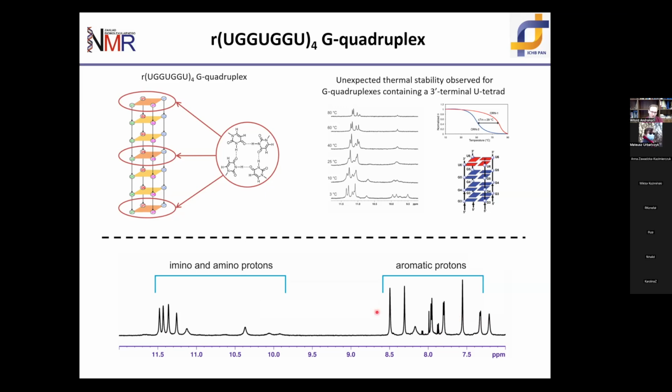They are very, very few, and this is because this molecule actually has a 4-fold symmetry. So all 4 of these guanosines will give you degenerate signals, or 4 of these guanosines will give you degenerate signals, and so on. And this simplifies the spectrum greatly, but on the other hand, you will see that it was quite a challenge for structure determination.